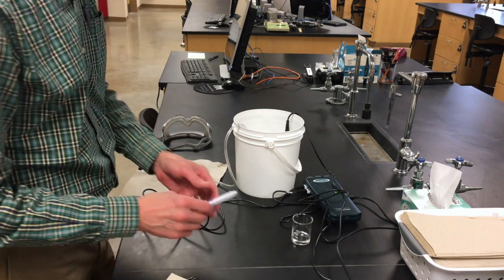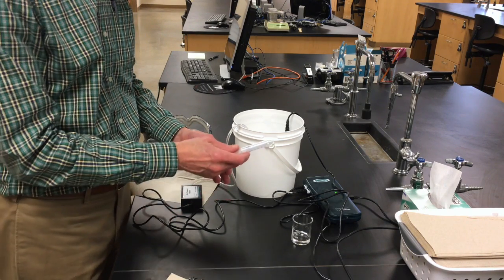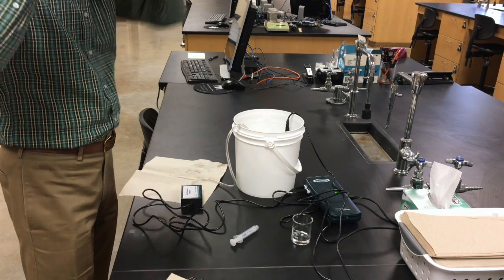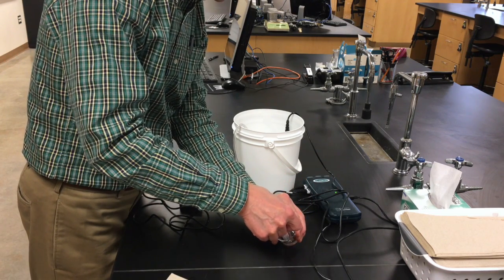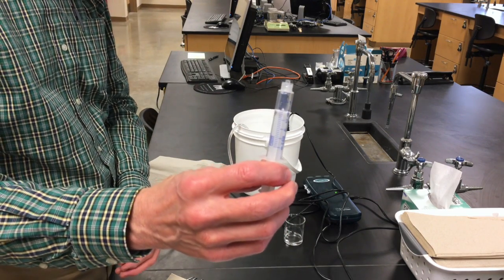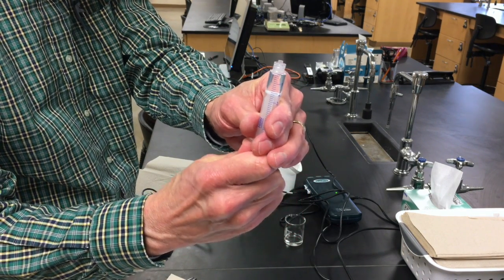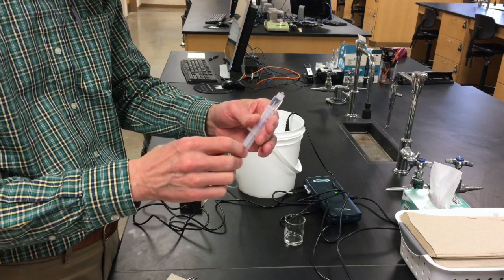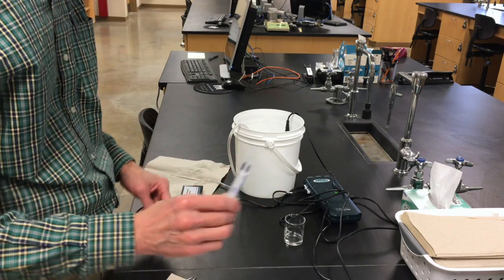Then we're ready to move to putting in the liquid. So we take our syringe, and I need to get my goggles on. I should have had them on sooner, but let me suck up 2 milliliters of this ethanol. So I've got 2 milliliters of ethanol there, you see. There's a little bit of an air bubble at the top. I'm going to try to push that air bubble out without making a mess of the lab here, because we don't want to squeeze extra air into the flask. We just want 2 mils of the liquid.